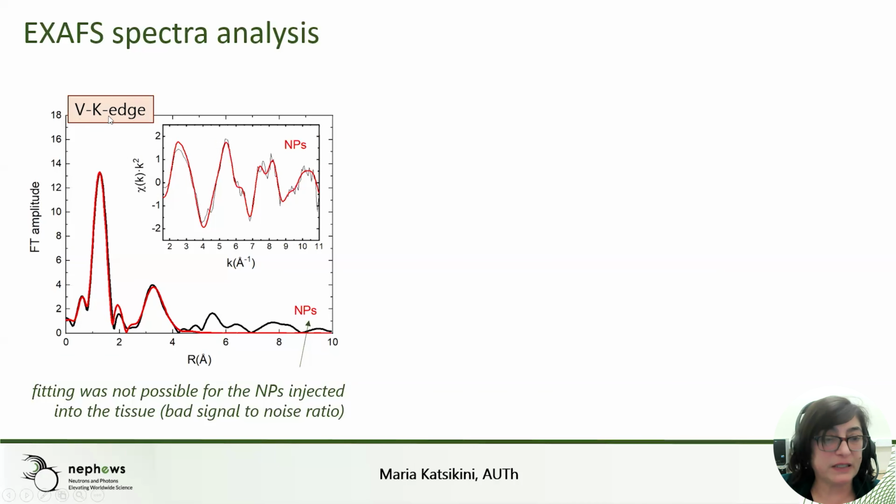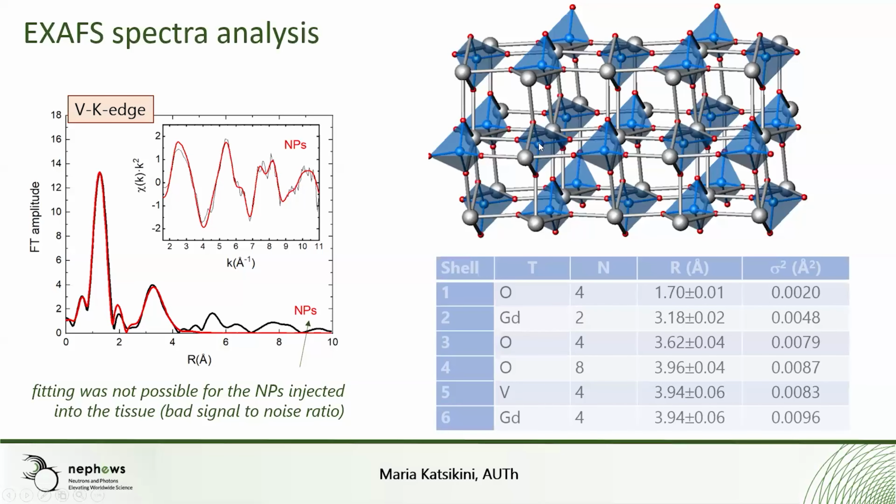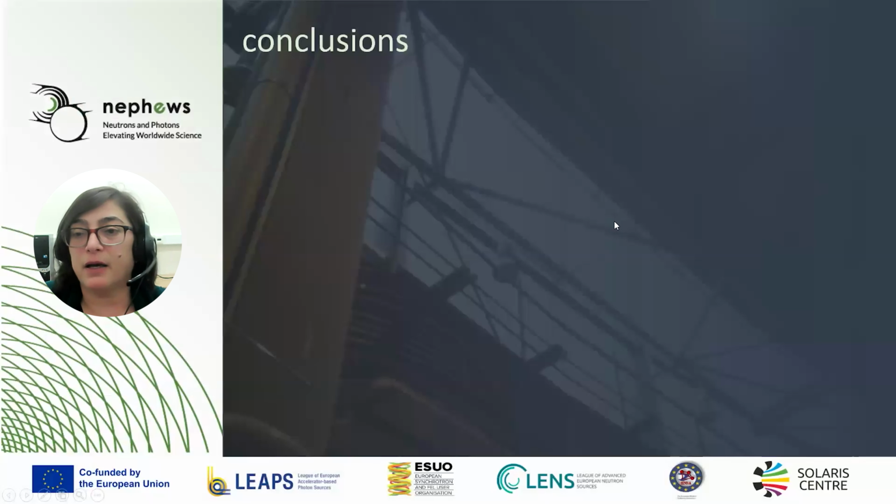In the case of the vanadium K edge, we analyzed the spectra only prior to injection, because the spectra after the injection were of bad quality. And in this case, we verify that vanadium forms tetrahedra, remains in the vanadate ions, and again we have the expected structure also from the vanadium point of view.